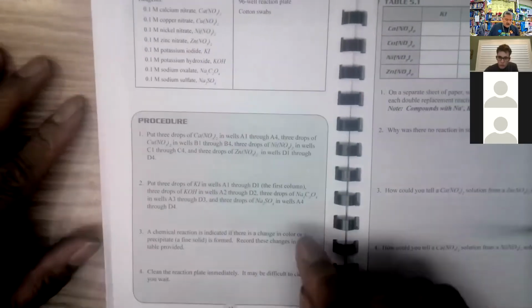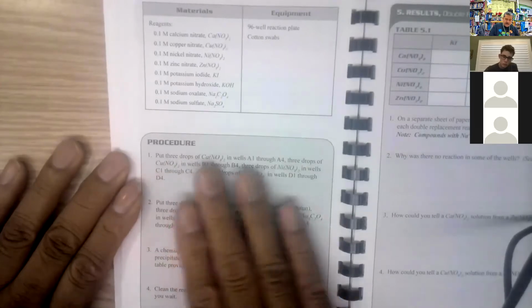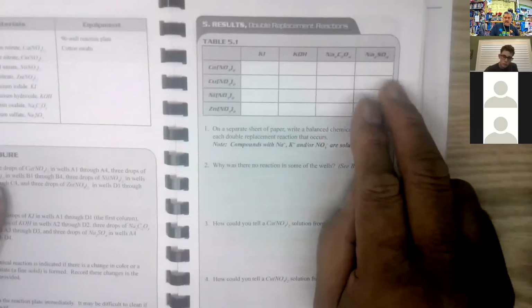So here are the chemicals that we need. Oh, I need a well plate. I don't have a well plate. Shucks. All right. Then it says to add these chemicals in here. These are all chemicals that you have in your kit. So I'm going to need to go get a well plate, and then we're going to follow these instructions right here, and then we'll take the information that we get, and we'll use it to complete this table.